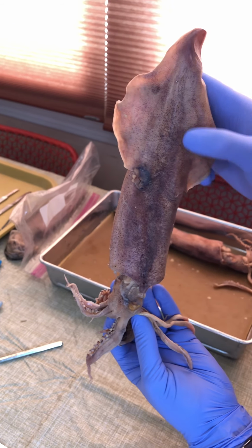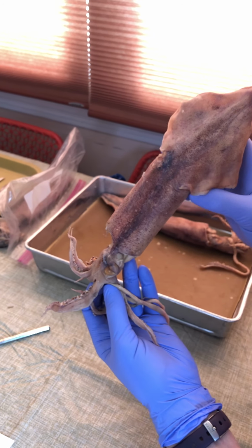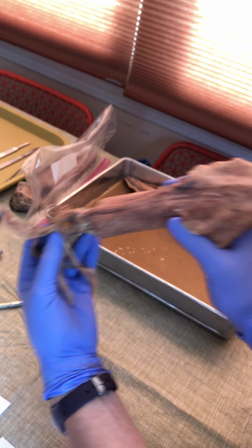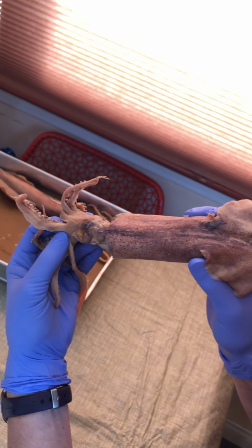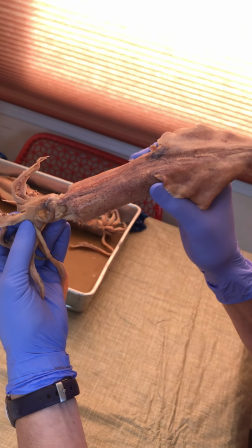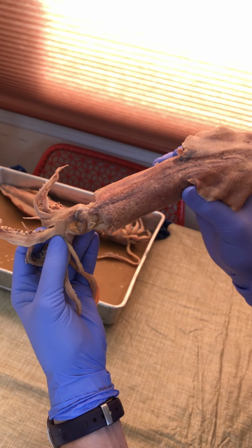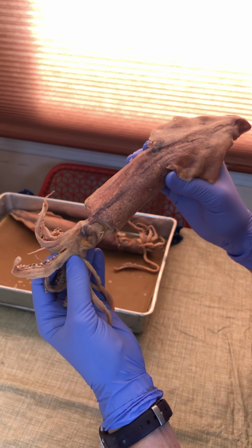And so maybe we can understand the symmetry of this animal functionally. In fact, this animal moves by jetting, whoosh, that way. Dorsal side first. So you can memorize the axes, but it would be cool to understand them, right? I think. Besides that, if I don't understand them, I can't remember them anyhow.